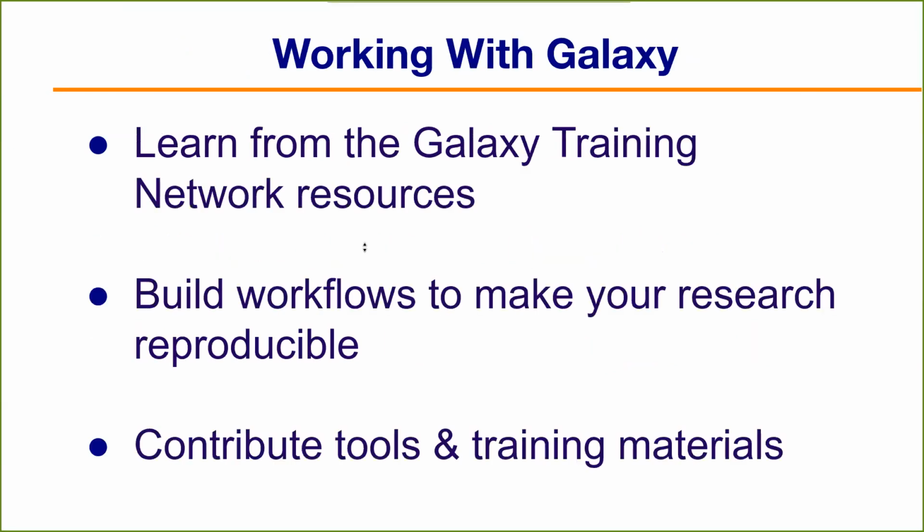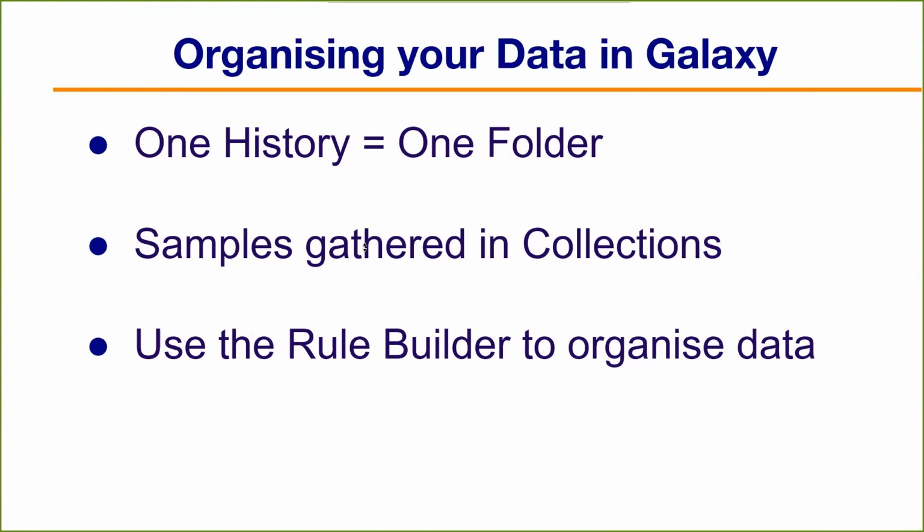Well, sorry, as I said, one history should be for one analysis. So don't mix your different analyses in one history. It gets confusing. So histories you can think of as one folder, okay? And then when you're analyzing multiple samples, they should be organized into collections.